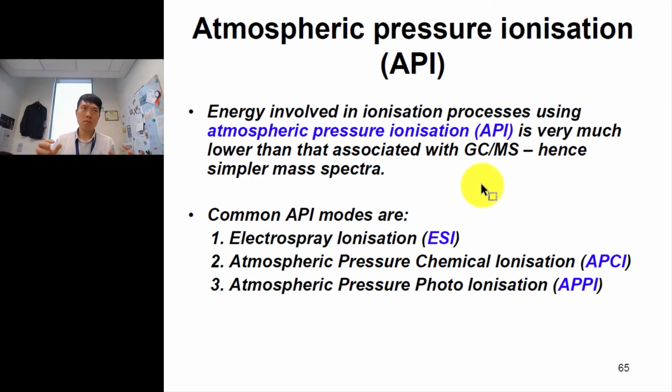Because when you have, let's say, a big picture and you cut too many pieces, you can't piece them together, it's just so confusing and cumbersome. What you want is to get a general picture first. For certain molecules, to affirm the structure, I think API is good enough. So some of these API modes include ESI, APCI, atmospheric pressure chemical ionization, and APPI, atmospheric pressure photoionization.